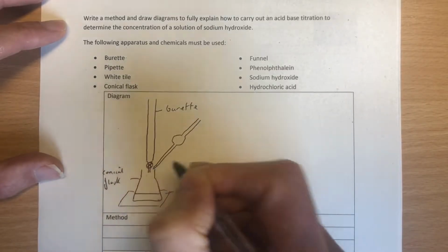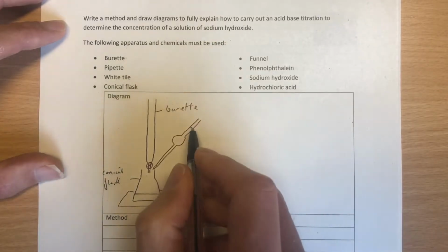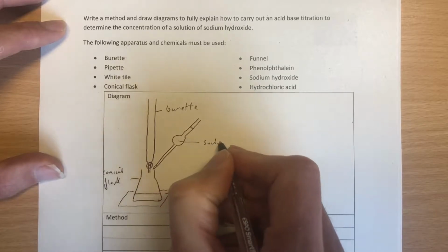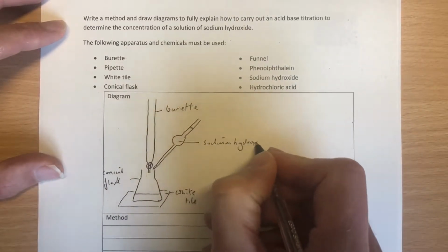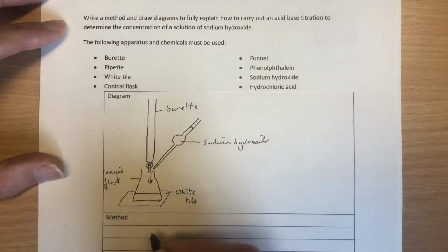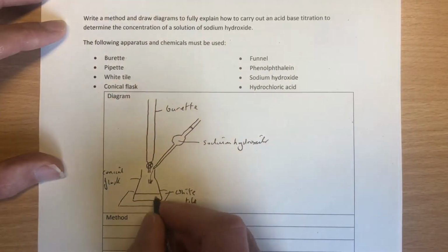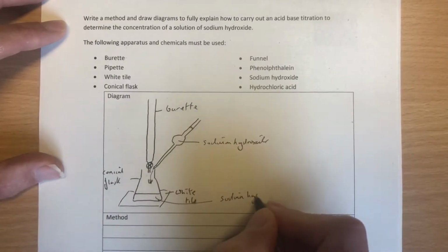We will measure out our sodium hydroxide. They have a marking on the top here, the pipettes. So our sodium hydroxide will be in there, which we will have sucked out of a beaker by the side, and then we should be putting it into the conical flask beneath.